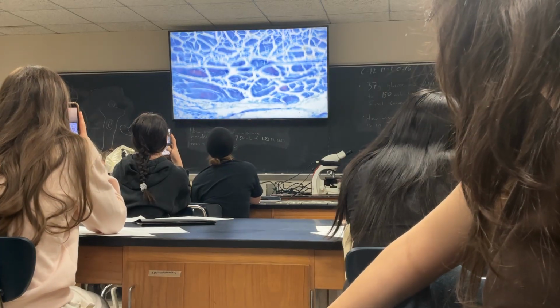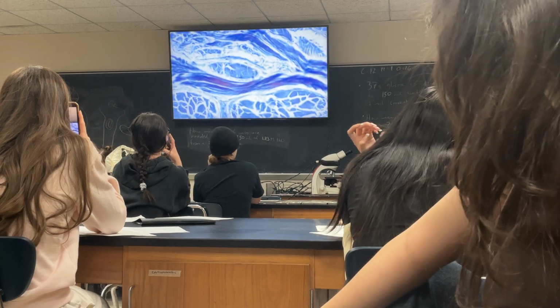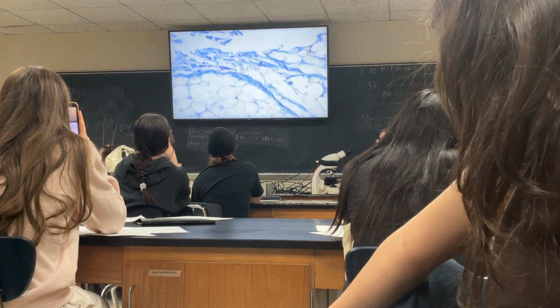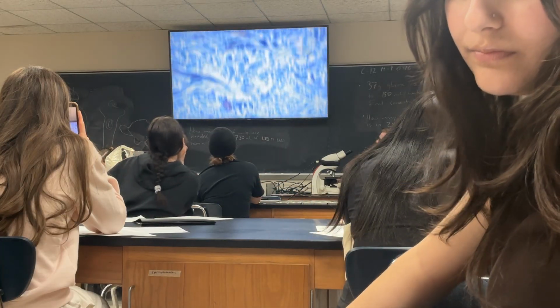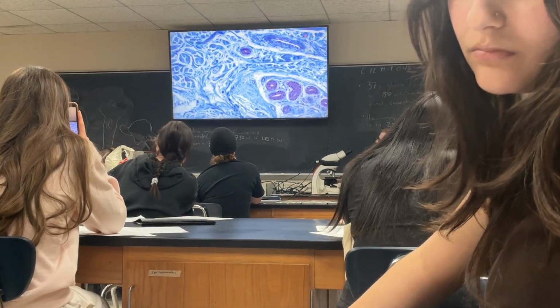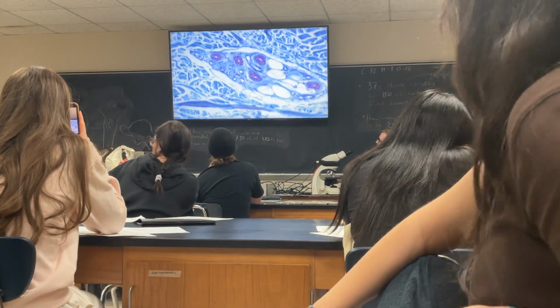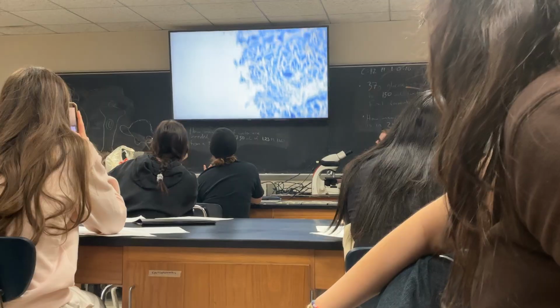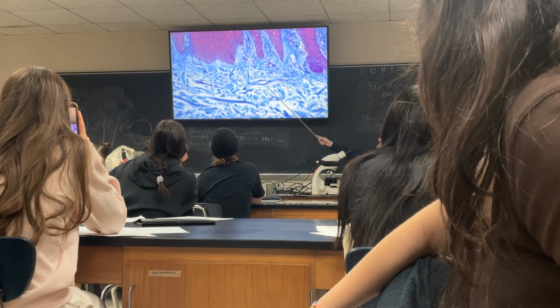It's a little bit tougher, but I think that's still. Stratified, a bunch of stratified cuboidal there. Adipose next to stratified cuboidal. Simple squamous epithelium.